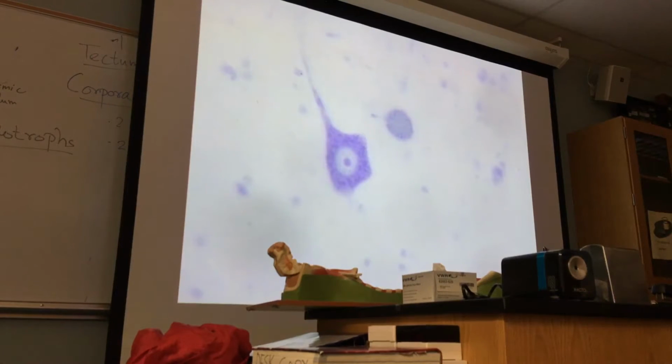So the nucleolus contains RNA, that's why the nucleolus has given a positive staining reaction. Could you see that? So if this is pointed, identify as indicated, you will see what you should write. Though it may not be in the word bank, I expect you to learn that nucleolus.